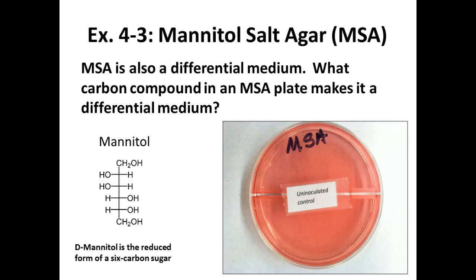Now we know this already, guys. What are some common byproducts of sugar fermentation? Acid, gas, one more. Our favorite on the weekends, alcohol, right?